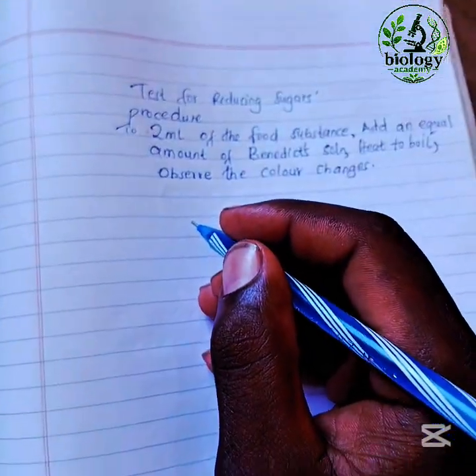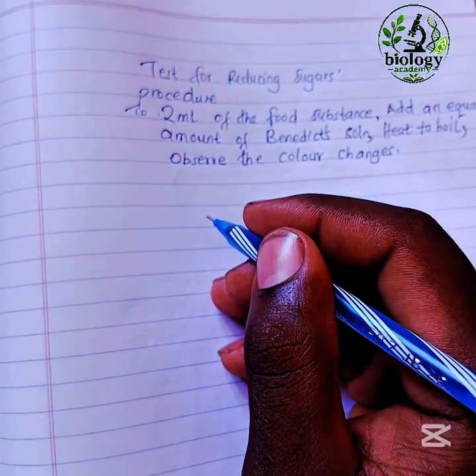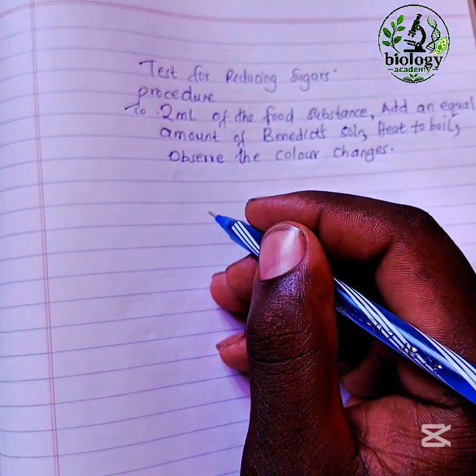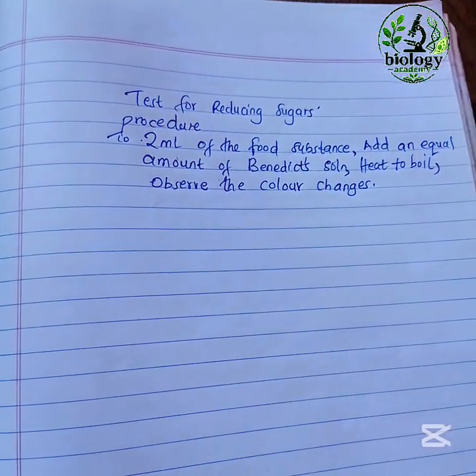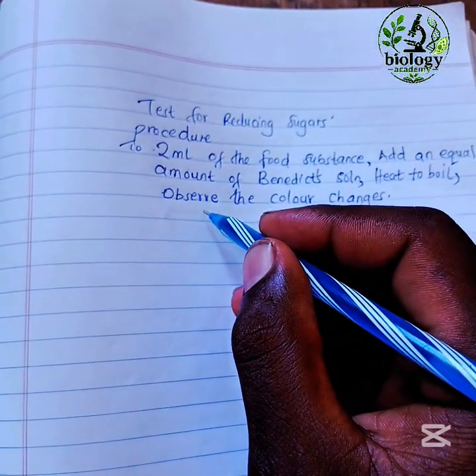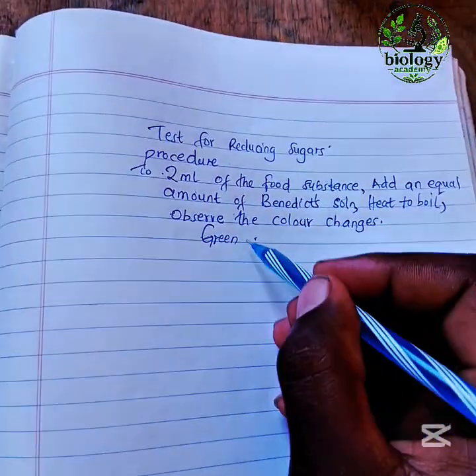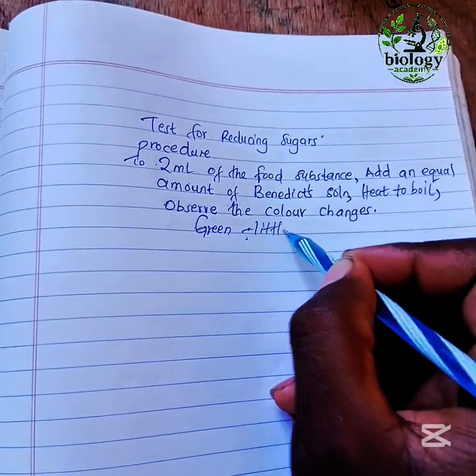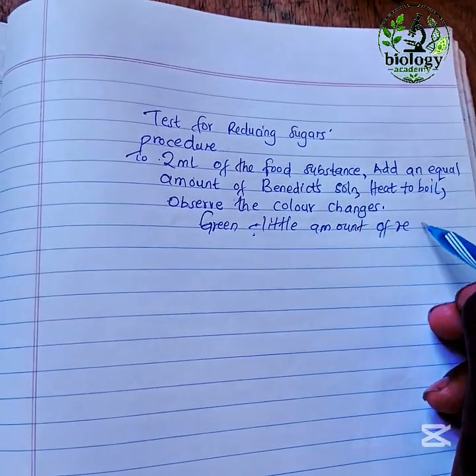Now, the observation you're supposed to see is the color changing from green to yellow or to brown. If the color changes to green, it indicates a little amount of reducing sugars.